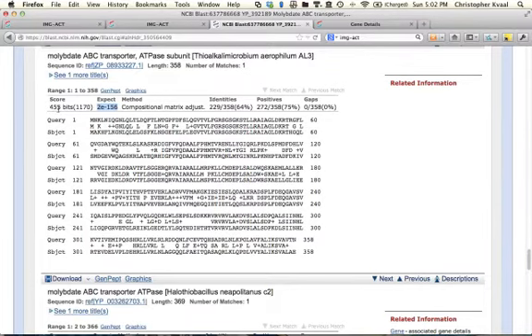The score is calculated by adding a number for each position. So here, when our alignment length is 358, we have 358 opportunities to have a number, a score, that aligns and adds up. It's additive. So here M and M line up, and so there's some number associated with that, maybe a 2, for example. N and A do not align, so that's a 0. K and K align, so that might be a 3. So up to this point you have 5. And as we move along, the computer calculates the BLAST score based upon a scoring matrix, which is a little bit farther along than we want to go.